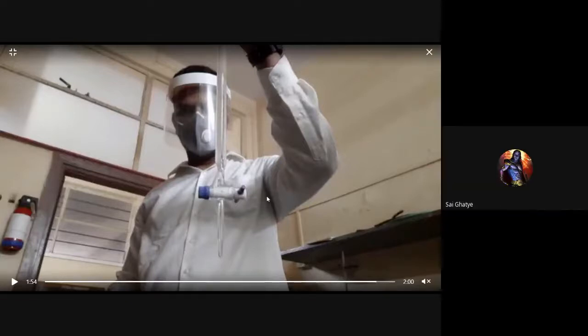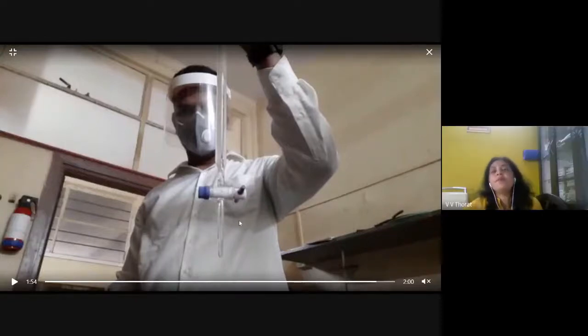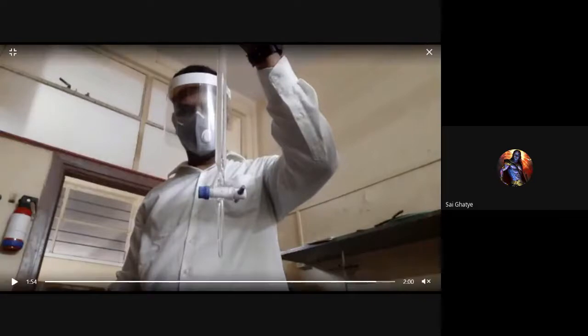Who will tell me? Who else is there in your class? Gaurav, I know. Gaurav, unmute. Yes, ma'am. Yes, tell me, Gaurav, what precaution you should take while filling the burette? Sai, both Sai. What precaution you should take while filling the burette? Answer in English. Lower meniscus should touch the level. Yes, the lower meniscus should touch the zero marking. Second precaution, Sai, tell me.